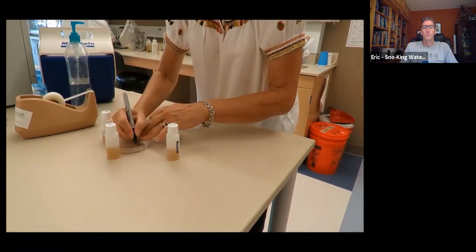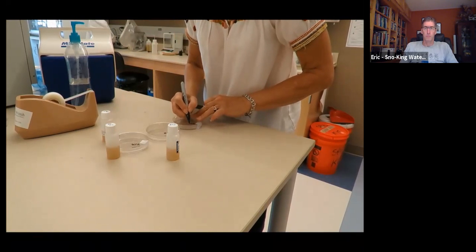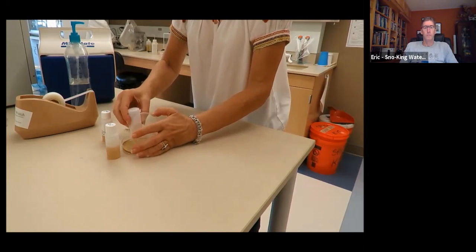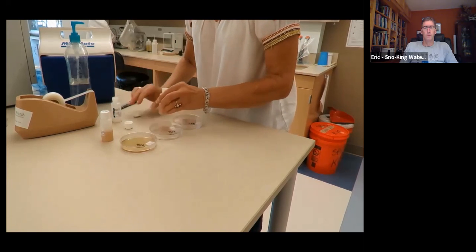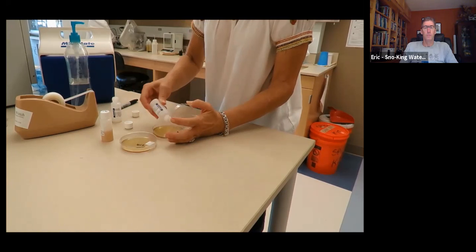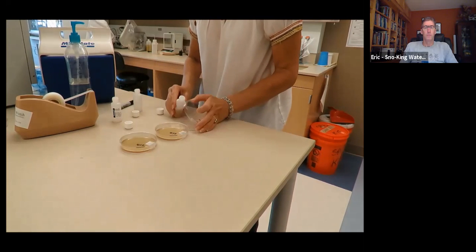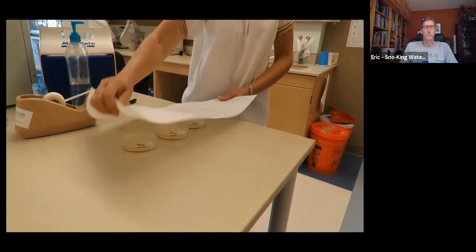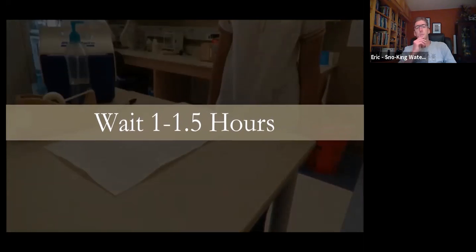Label the plate lids with labels that correspond to the inoculated media bottles in data form. Lift the top of the Petri dish just enough to pour the contents of its corresponding media bottle into the plate. Do not slosh the media onto the sides or lid of the plate. Record the time you plated your sample on your data form next to incubation start time. Be sure to shield the sample plates from direct light. Leave the plates undisturbed until the media has gelled, usually about 1 to 1.5 hours.